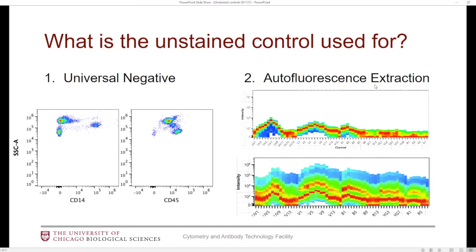For autofluorescence extraction, this feature is useful sometimes when you have really high complex autofluorescence, like this lower example — this is an unstained tissue digest. This is really on the extreme side of things; most samples are probably not going to look like this. This has multiple autofluorescence signatures in it, whereas this top one has a single autofluorescence signature that's relatively low — this is probably PBMCs. If you want to use the autofluorescence extraction feature, it will take the signature of the autofluorescence from your unstained tube, kind of turn it into its own fluorophore channel — the software calls it the AF channel — and that could potentially improve your data.